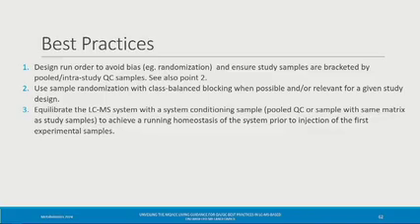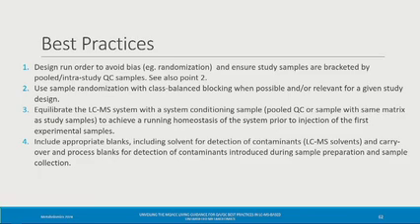With LCMS, you want to make sure that you're equilibrating your LCMS system and conditioning it with a pooled QC or some other kind of throwaway sample, basically, that lets you equilibrate the system so that when you start running your actual samples, the system is stable and ready to go, the column is well behaved, et cetera. And again, I have some data that I'll show about that in a few slides.